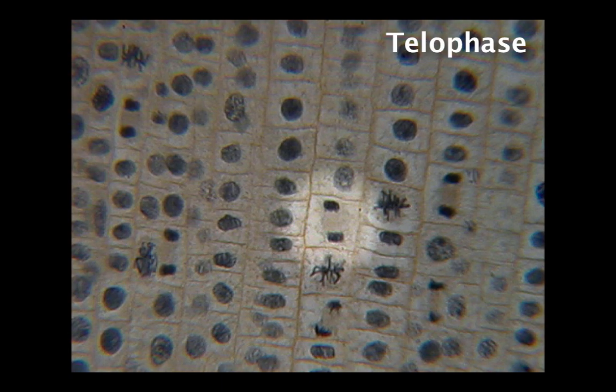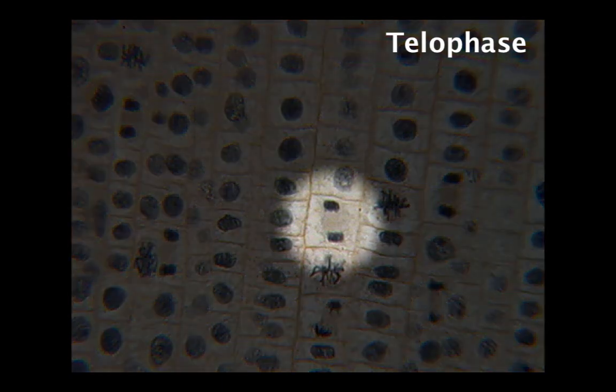This cell is going through telophase. The nuclear membrane is reforming, and the chromosomes are uncoiling to form chromatin, so you see a much darker dot, two dots in the same cell, in other words, two nuclei in the same cell.